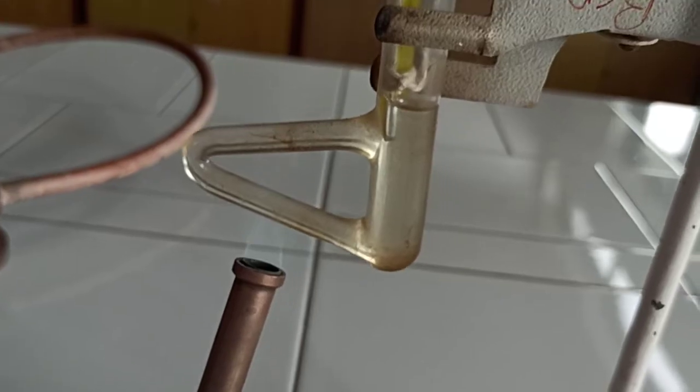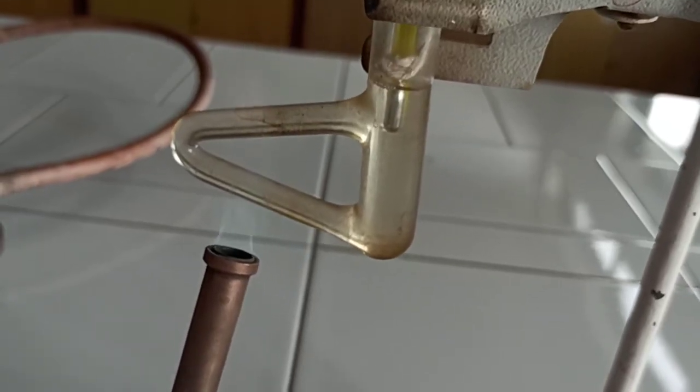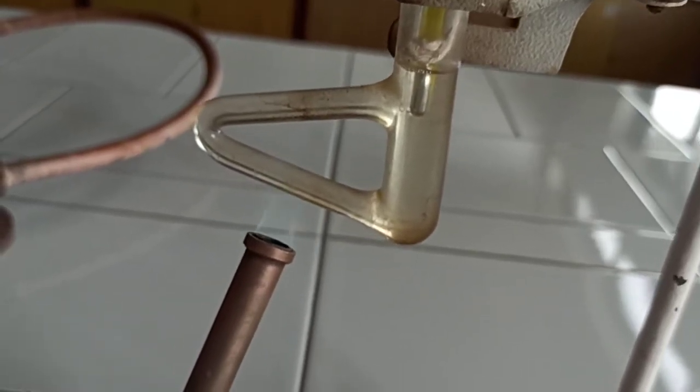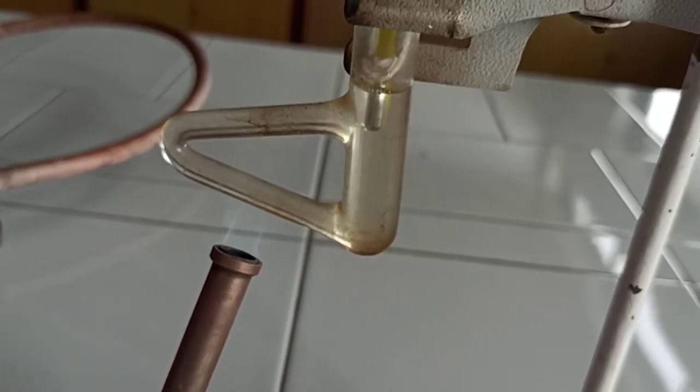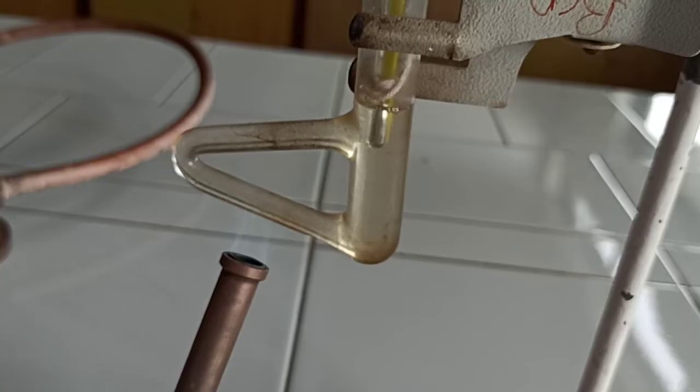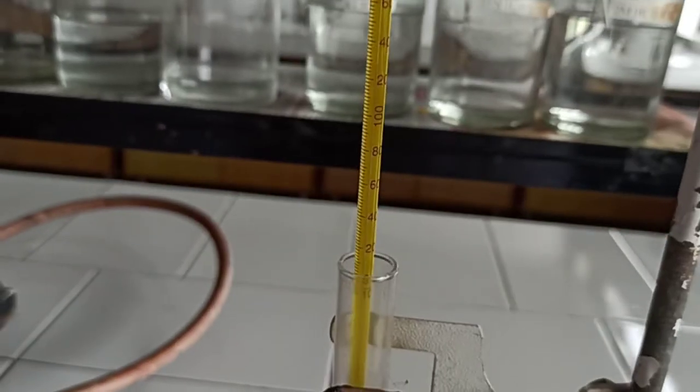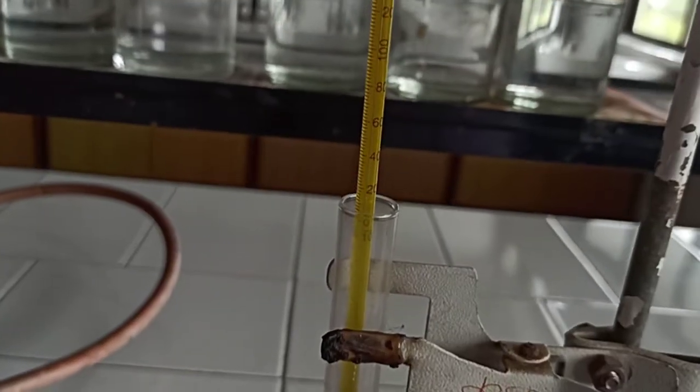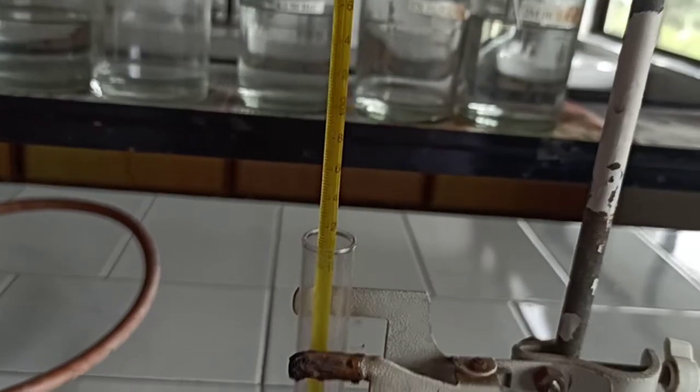See, we are continuously heating this tilts tube and there is a circulation of that liquid paraffin. See, the mercury goes upward. That means temperature gets rise.